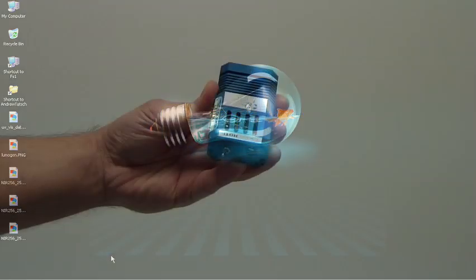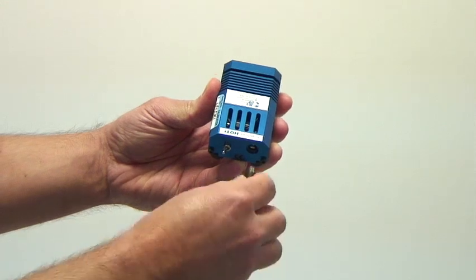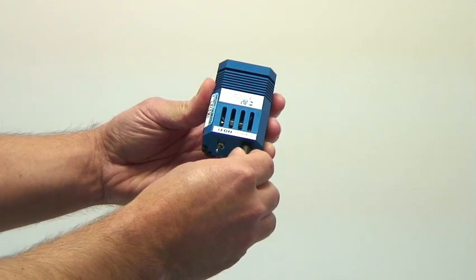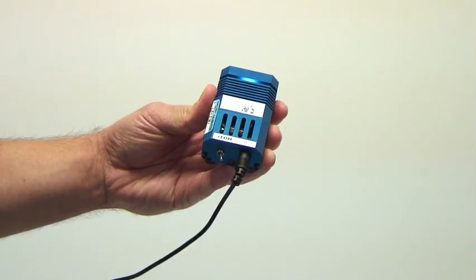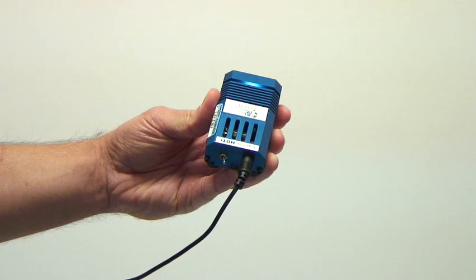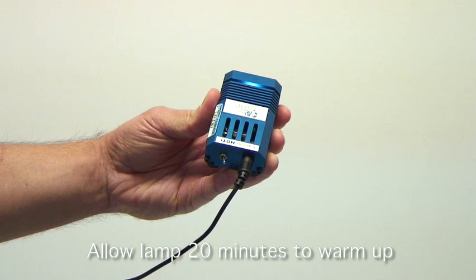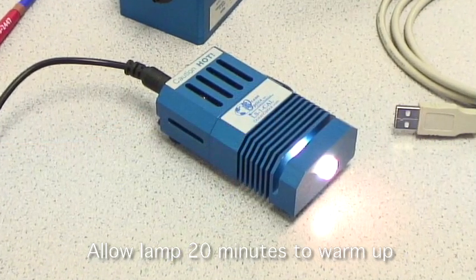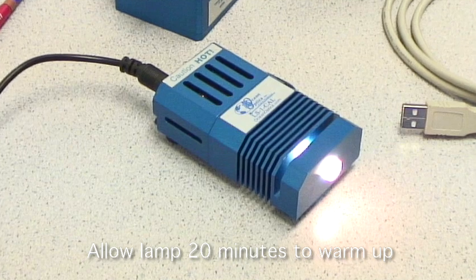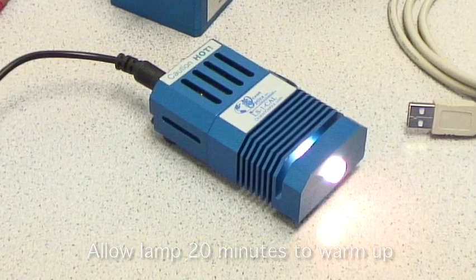First, you should connect the power to the light source and turn it on so that it can begin to warm up. For the LS1cal-INT, it is recommended to let the lamp warm up for at least 20 minutes.